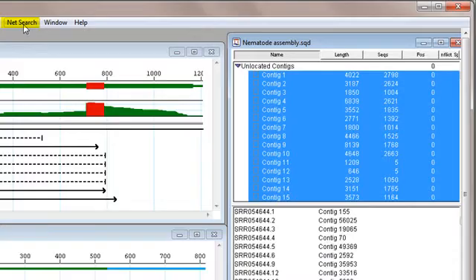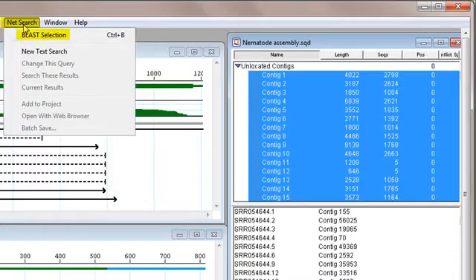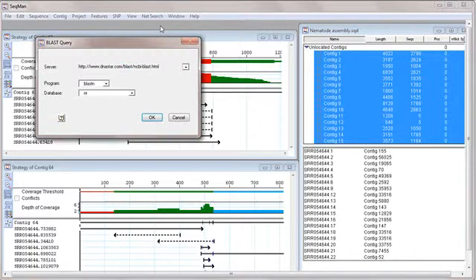I can also BLAST all of my de novo contigs to identify isoforms and alleles.